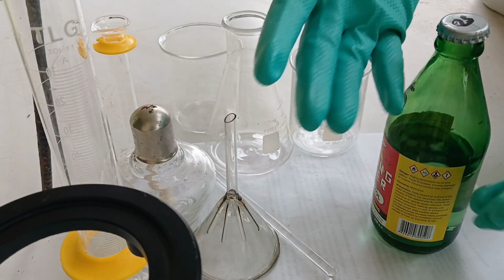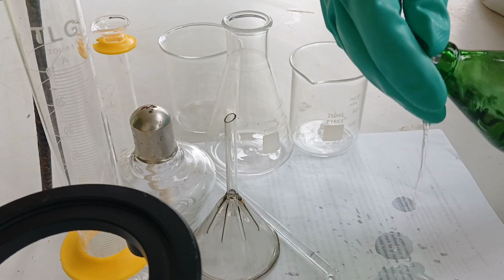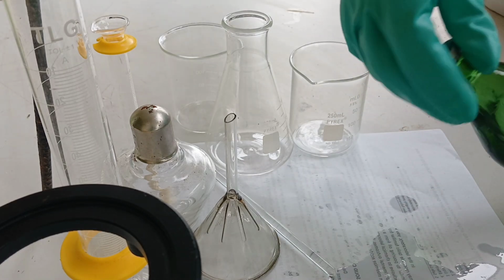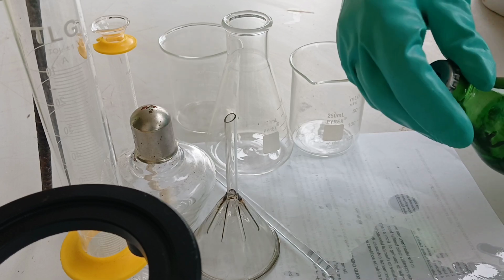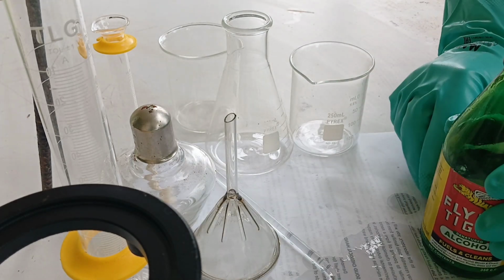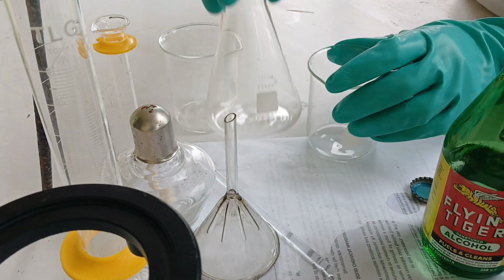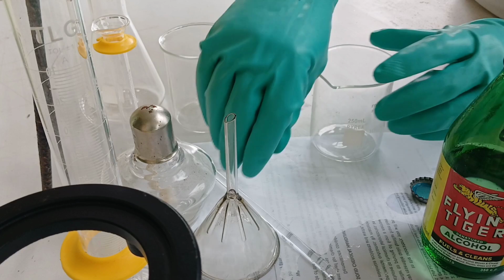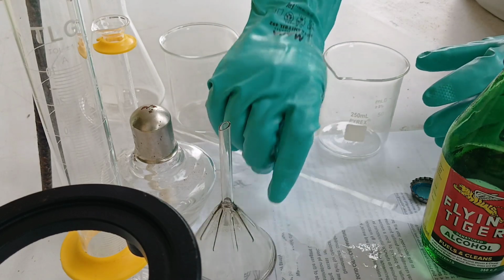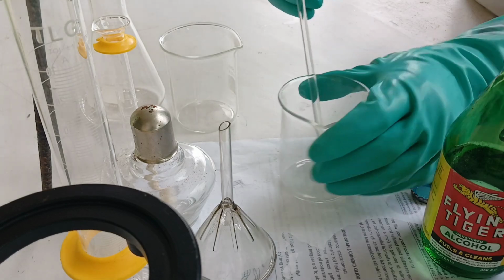Of course, from your mother container, that's the denatured alcohol label. As you can see, oops, naihabo gamay. It's supposed to be scripted na siya, kaya na-open na siya gamay. But if that is very tightly closed, you have to wet the lid first before opening para ma-loosen siya, and then you could easily open the lid. Motogid dapat siya. But anyway, let's proceed.